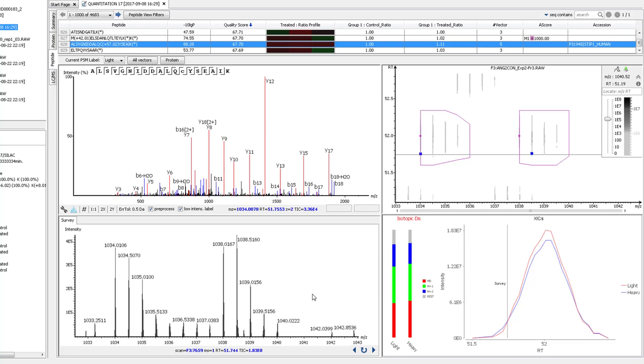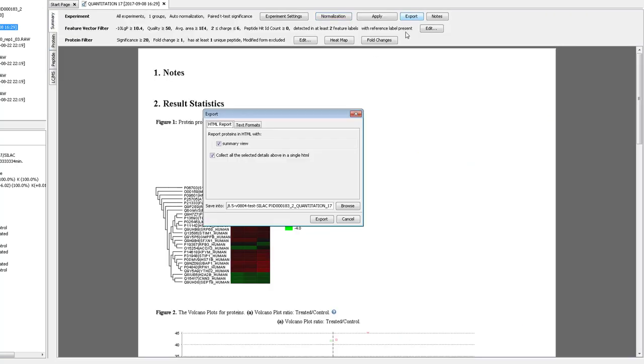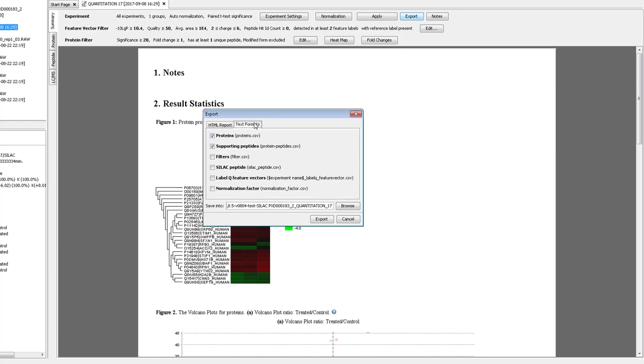Once you're sure that the quantification results are accurate, go back to the summary page, click the export button, and different HTML and text options are available for you to export your data for further analysis.